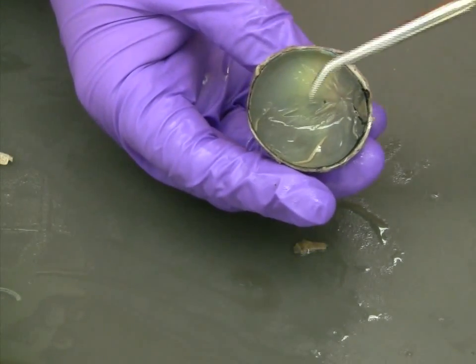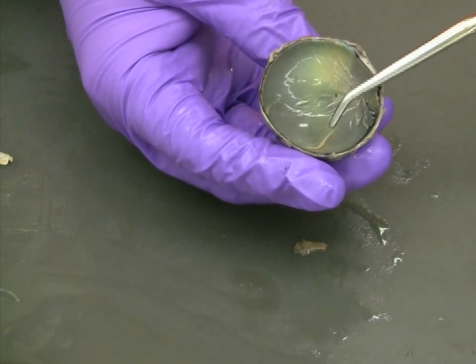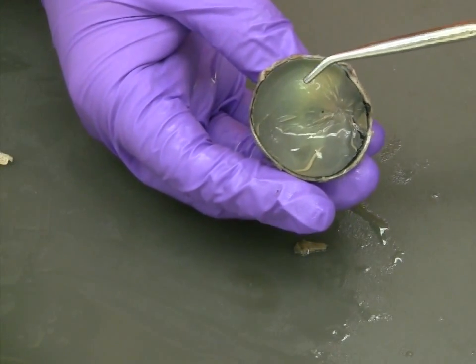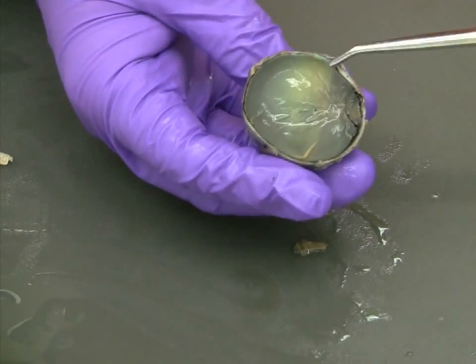Examining the rear half of the eye that you set aside earlier, the first thing that should be immediately apparent is the thin membrane covering the eye wall. This membrane is very delicate and comprises the retina at the back of the eye.